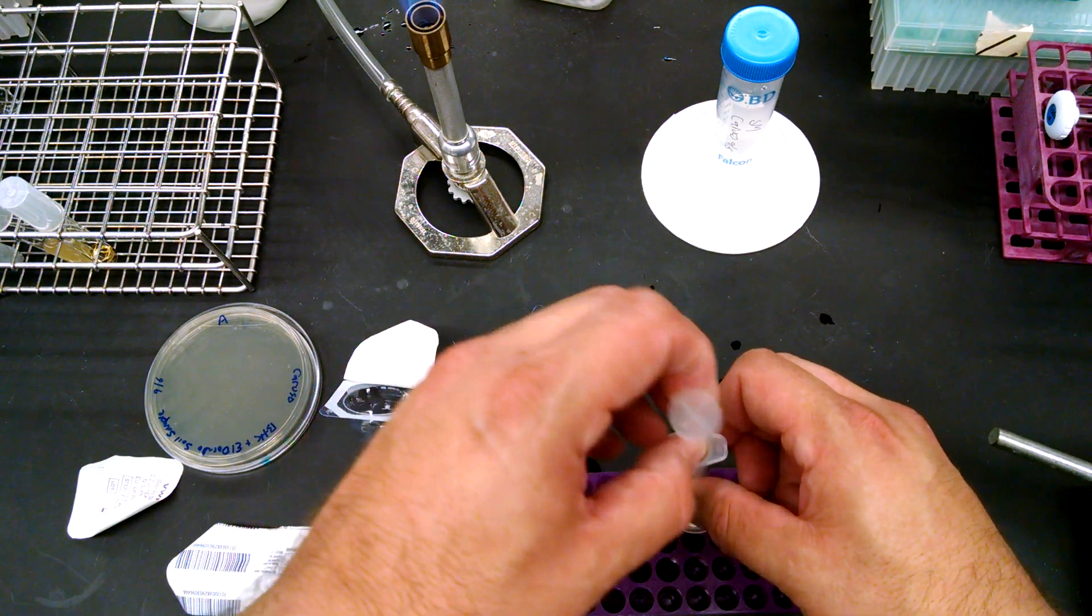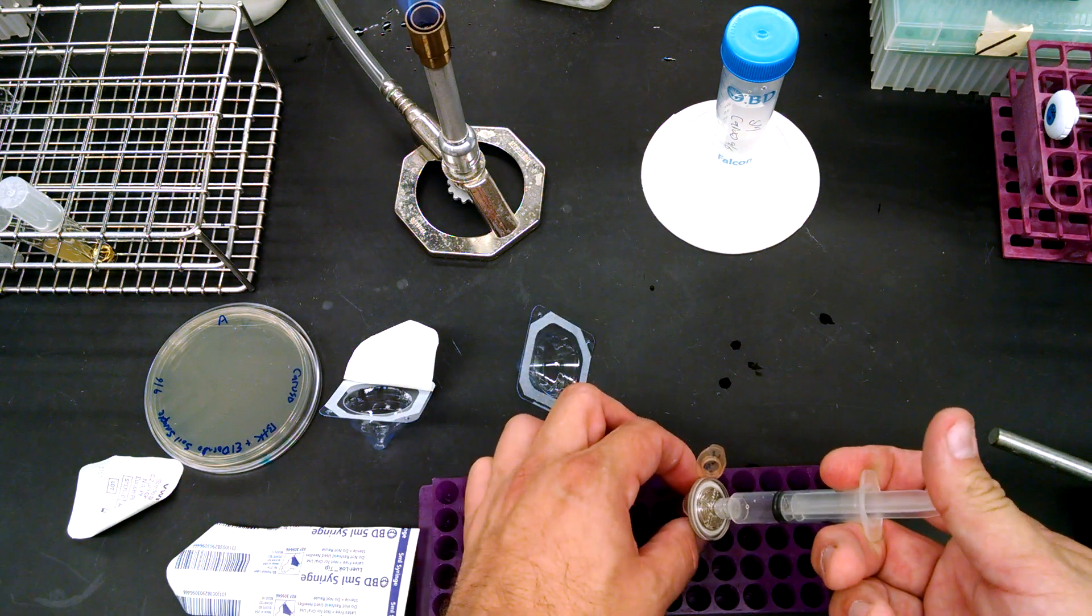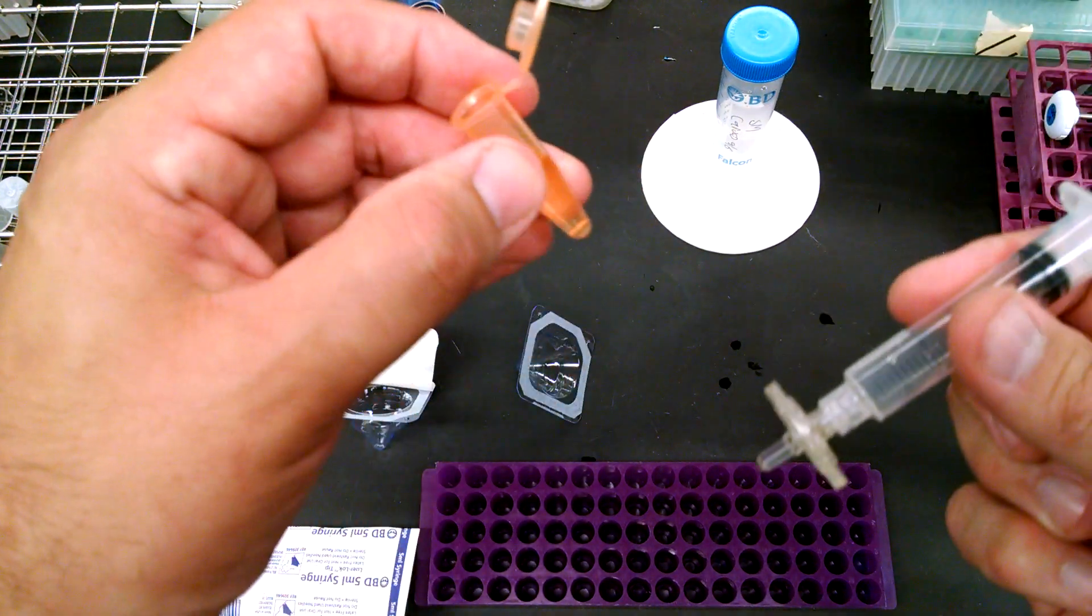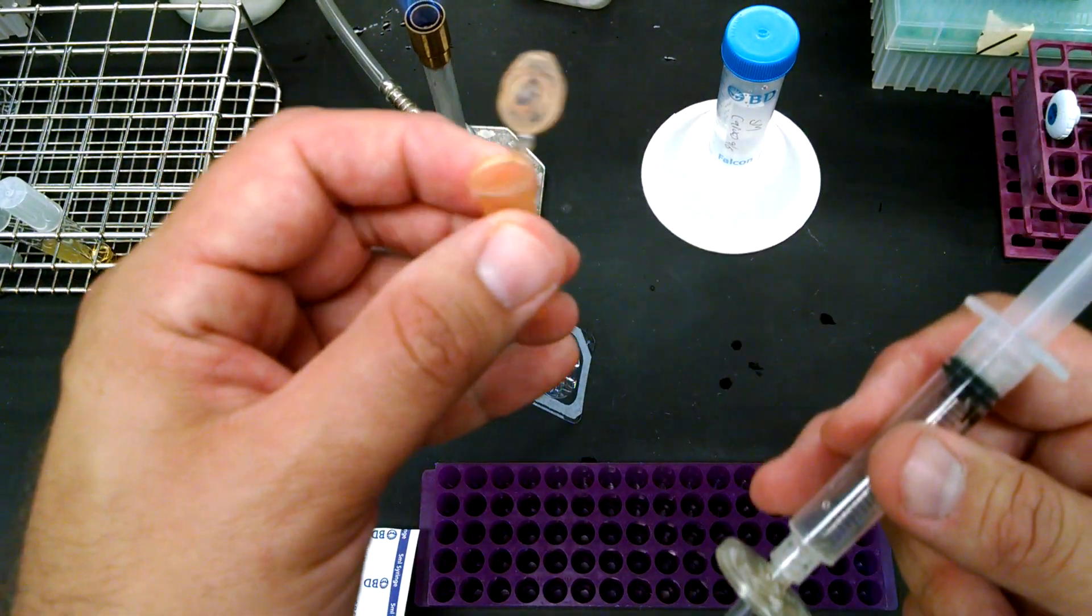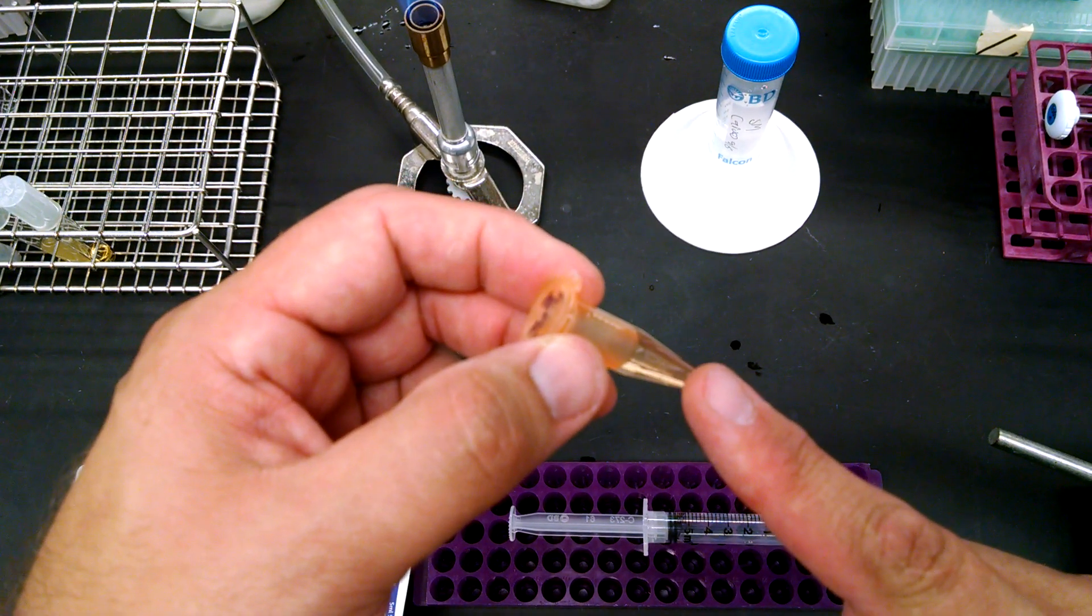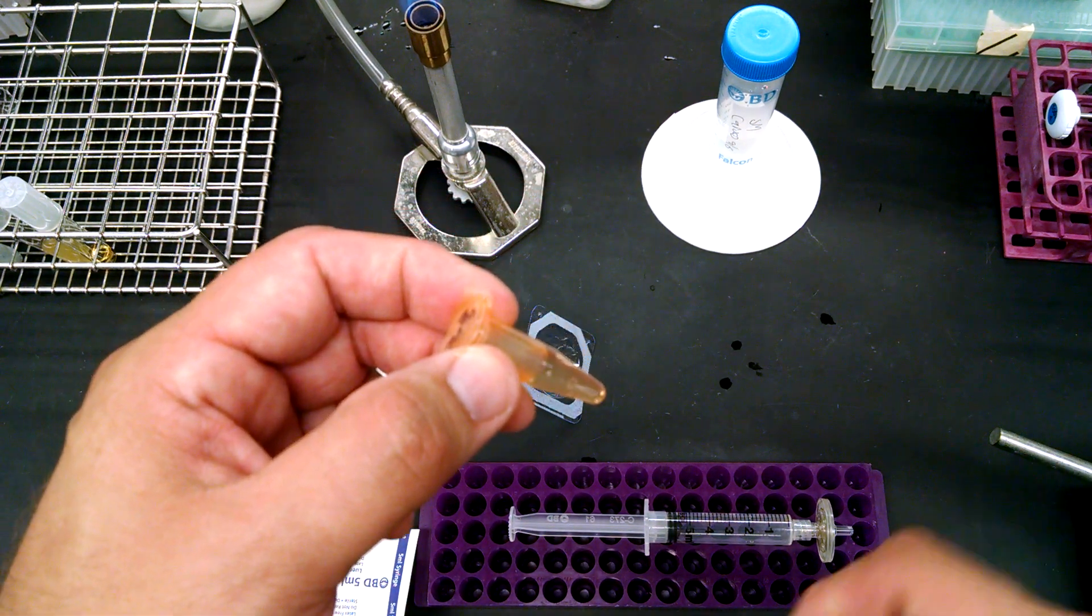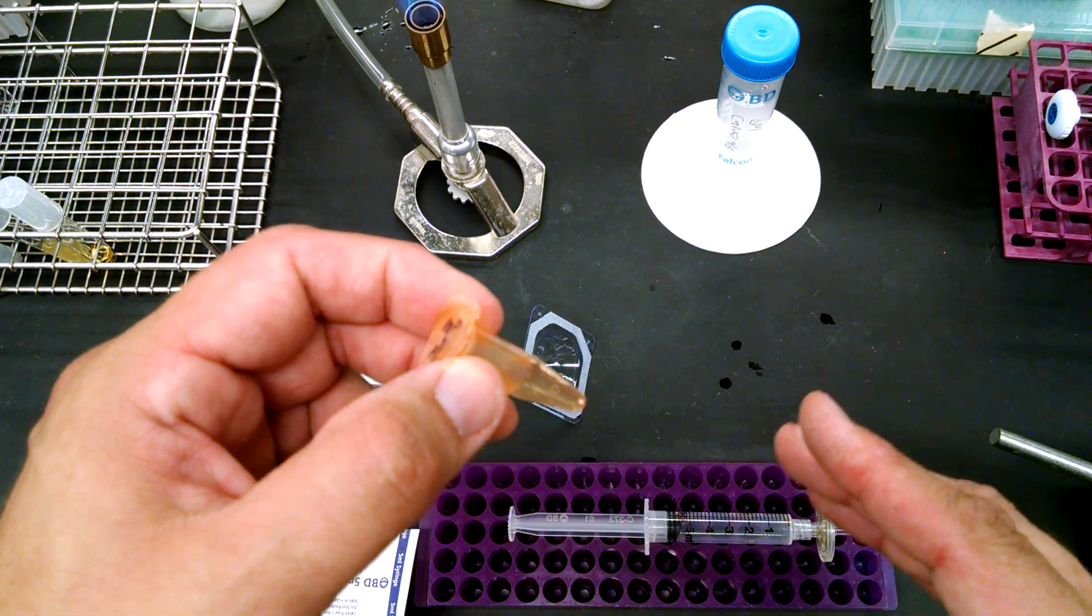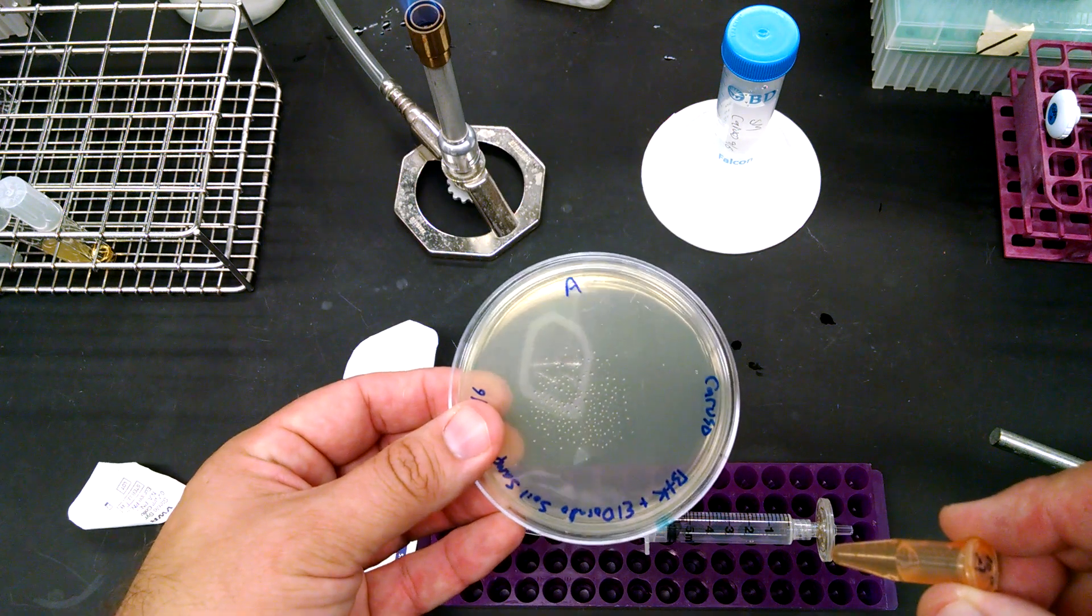And when you push it through, instead of that dark brown, yucky looking sample that we had, now what we have is crystal clear again, but hopefully filled with phage. So what I'm going to do now is I'm going to take 50 microliters of this, and I'm going to add it to a half mil culture of BTK. Let it sit for five to 20 minutes maximum, just like we did on that first day. Add some top agar, put it on this plate.